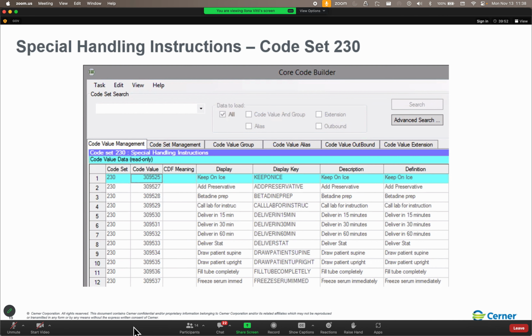Because folks, I don't know when the last time you had a blood draw, but I can guarantee I had several orders on my last blood draw. And there's no guarantee that they were all going to be netted to the same accession number. So there's reason number 1 why we say, hey, every area except AP, please go ahead and use the Julian formatted accession numbers: because that bucket refreshes every year.